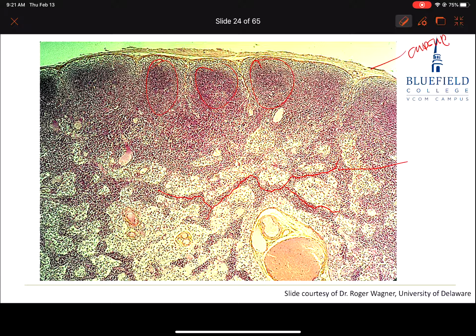Is there the T cell dying structure that you're on this? No, okay, are you thinking of Hassall's corpuscles? Those are in the thymus. Oh, okay. Yeah, maybe I'll look at this and ask, are these Hassall's corpuscles? If you went to higher power and focused on them, you'd say, no, they're not. Okay?